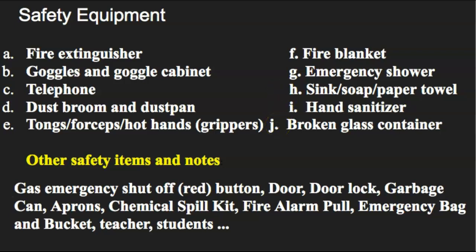Broken glass container, I'll show you a picture of that. That'll be located in our room. For us, that's a container where anything that gets broken that's glass or a pointy, sharp object, we put it in there to protect ourselves and also to protect our custodians.